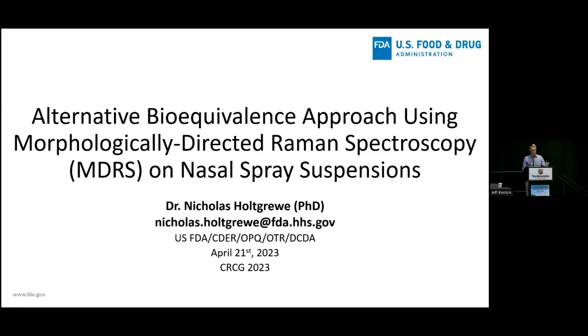So the title of my talk today is Alternative Bioequivalence Approach Using MDRS, Morphologically Directed Raman Spectroscopy on Nasal Spray Suspensions. So before we begin, I realize that nasal spray suspensions are not orally inhaled drug products, but they are very similar in that they are locally acting, and I think we can learn a lot from a success story of using MDRS for product-specific guidances. And this is to kind of bypass this endpoint clinical study.